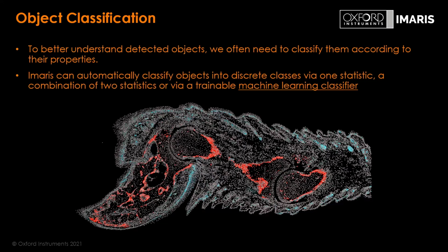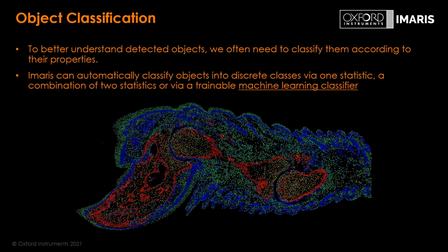So you do a few of them and you teach the software to learn. Okay, so train and predict algorithms, where it identifies for you what each of those cell types is without you having to manually assign them to each cell. Just do a few and you teach it. It's an iterative process. That's the most standard way of doing machine learning.